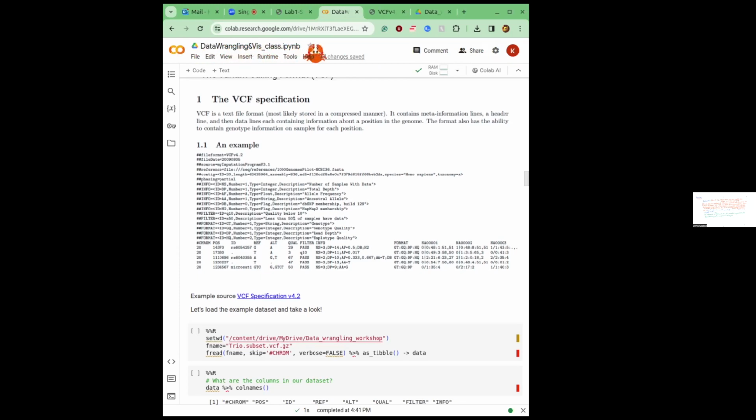Or if you want to understand insertions and deletions, that's actually very difficult to tell, because the way that the electrical currents and the signals are run, you just get insertions and deletions that happen by random chance or frequency. When you look at the actual nanopore, it's k-mers of 5 that are being read simultaneously. Especially with homopolymers, long chains of the same base, the accuracy, although I think all the systems have that error associated with it, is very much accentuated in nanopore. You won't get an accurate estimate for the size of the homopolymer.